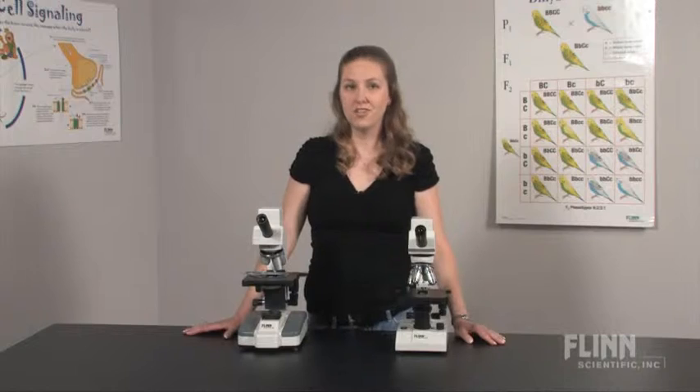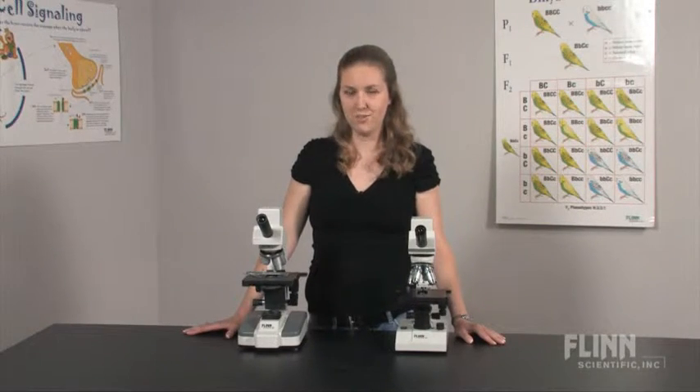Bring digital microscopy into your classroom with the high-quality, durable Flynn Digital Microscopes.